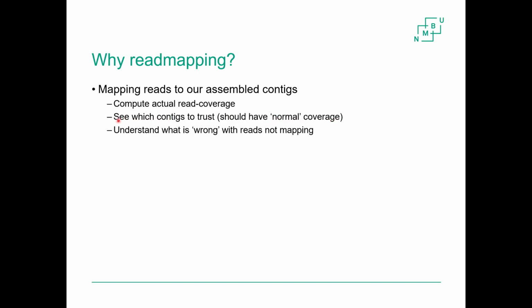So actually the QUAST software that we have used in this course can also be told to do this. If you feed the raw reads to the QUAST software, there are some options for that. QUAST will also do read mapping and report the coverage of the different contigs. But we haven't done that because it's very time consuming.